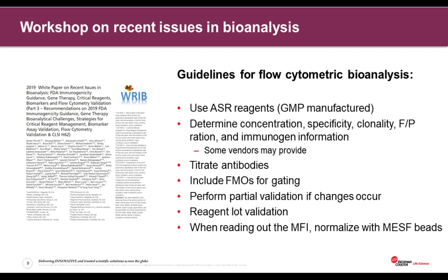Reproducibility issues, especially in bioanalysis such as flow cytometry, have been addressed in an annual workshop called the Workshop on Recent Issues in Bioanalysis, where leading global biopharma, CROs, biotech companies, as well as regulatory agencies come together to discuss issues and develop guidelines and specific information that can be disseminated across the scientific community to implement rigor, so that we can develop better studies and accurately expedite the development of therapies.